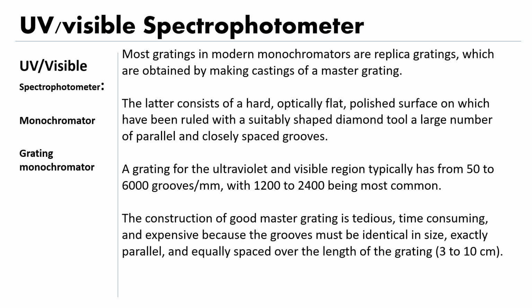So the construction of a good master grating is tedious, time consuming and expensive because the grooves must be identical in size, exactly parallel and equally spaced over the length of the grating, that is the 3 to 10 centimeter.